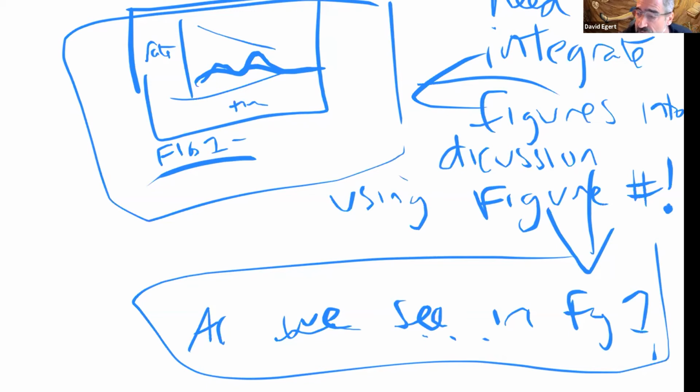Then there was the agar diffusion. Was there anything surprising about what happened when potassium permanganate and methylene blue were diffusing in the agar? And what is the difference between potassium permanganate and methylene blue?